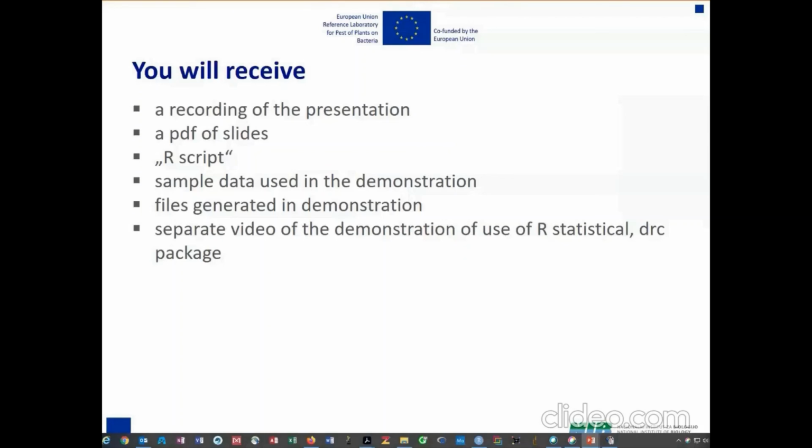And going back, this will probably not be a concentration straight 10 to the 5, but it might be, I don't know, 7.056 times 10 to the 3. And this is something that we would not be able to determine experimentally. We have to go in between the experimental points that we have.